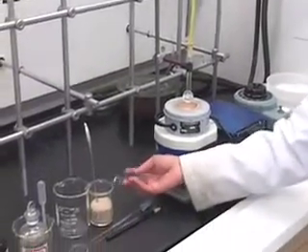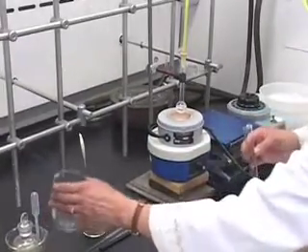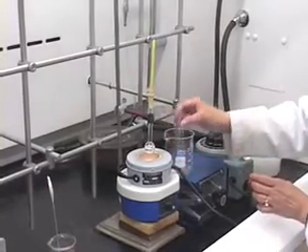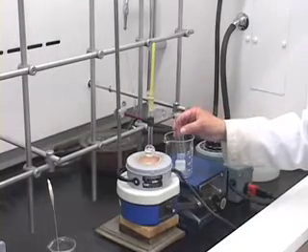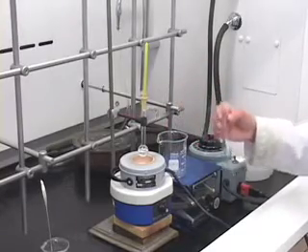We are going to collect our product distillate in this reaction tube. We will take the beaker and place this tube inside the beaker. However, we want to make sure that the product we are going to collect will not evaporate off, so you want to have ice in this beaker.